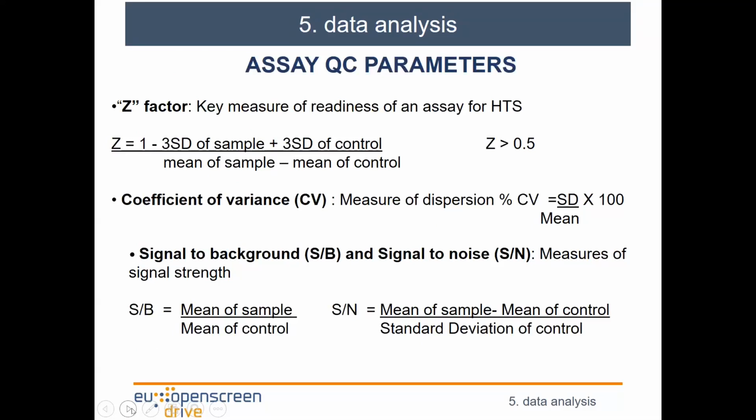Thank you. Okay. The last part of this introduction course is related to data analysis. There are some parameters that need to be evaluated, the quality control of the assay, and some of them are described here in this slide. Quality control is very important in the analysis, to be sure that the results and the data that we obtain are robust, and then we get a very good outcome of the assay that we are performing.